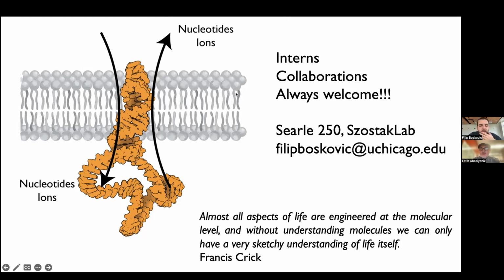So Silarine, there is a question. Is there any Nanopore specific library preparation kit for single cell library preparation, or can we use the 10x Genomics Chromium library preparation kit to run on the Nanopore sequencer? So there's the first question. That is a relatively new thing. I think it was done this year with a collaboration of Oxford Nanopore Technologies and 10x.